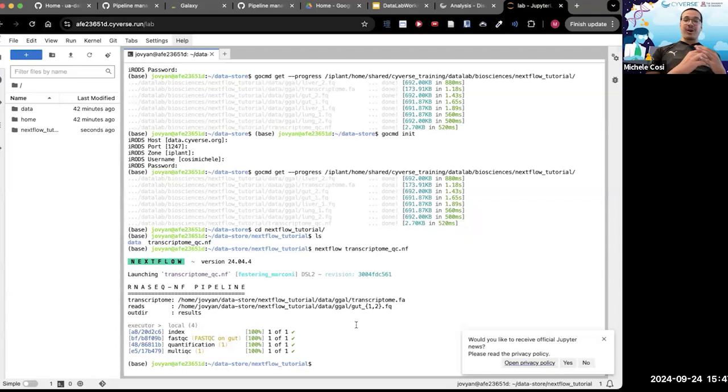What I'm going to talk about right now is what you are seeing on the screen. So Nextflow, first of all, detects when it's running. So it says, hey, I'm running this specific script, and I'm going to give it a nice, cute little name. And for me, it was festering Marconi.